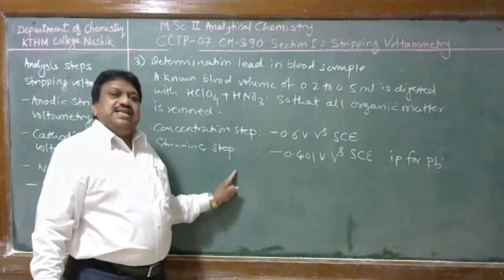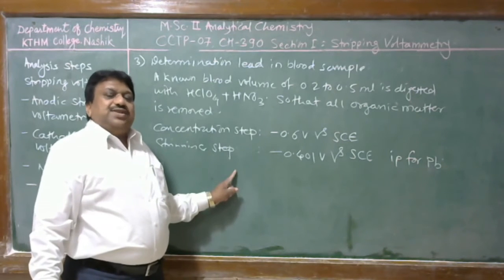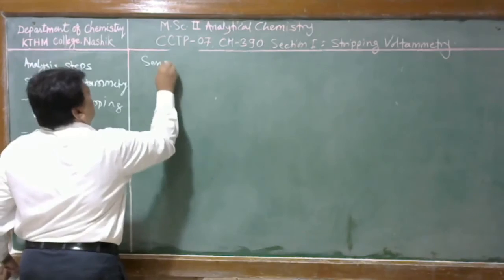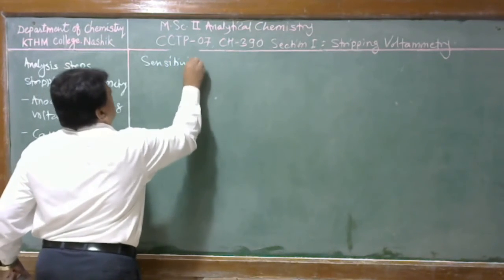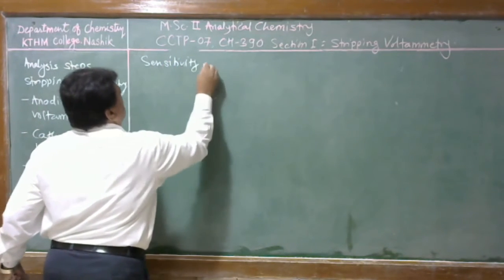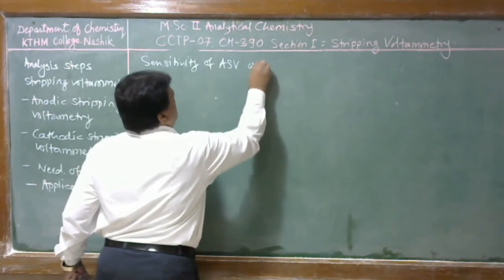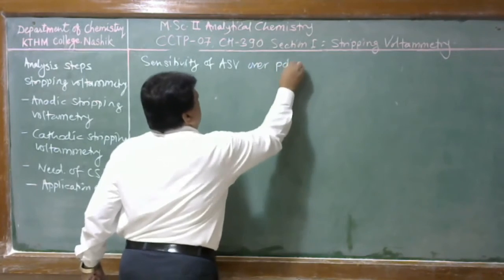Now we discuss the sensitivity of stripping voltammetry over the polarographic method, that is, anodic stripping voltammetry over polarography.